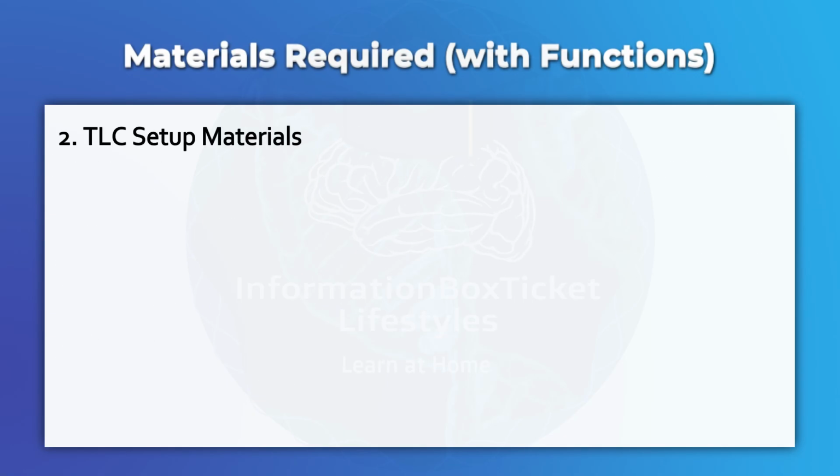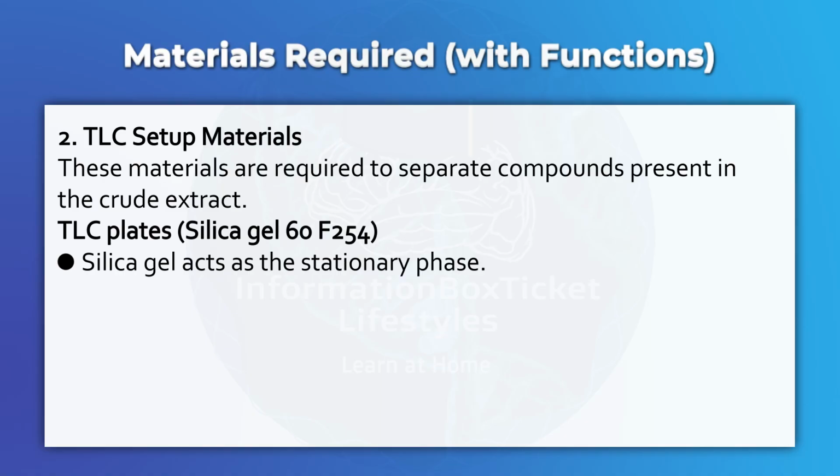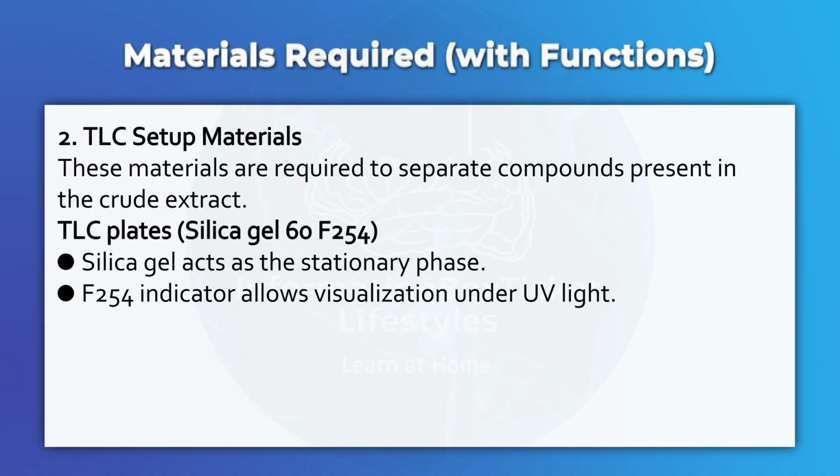2. TLC setup materials. These materials are required to separate compounds present in the crude extract. TLC plates, silica gel 60, F254. Silica gel acts as the stationary phase. F254 indicator allows visualization under UV light.